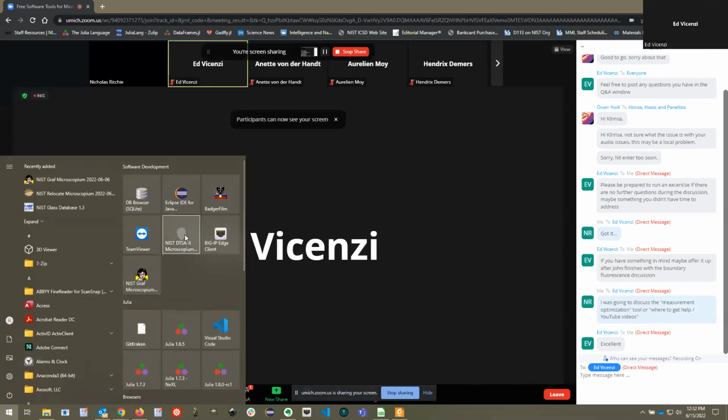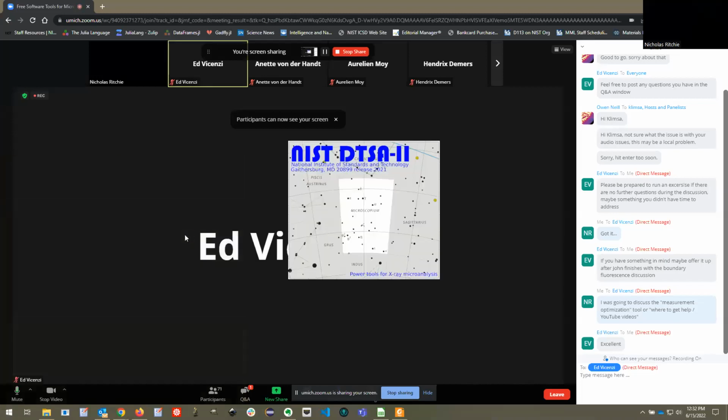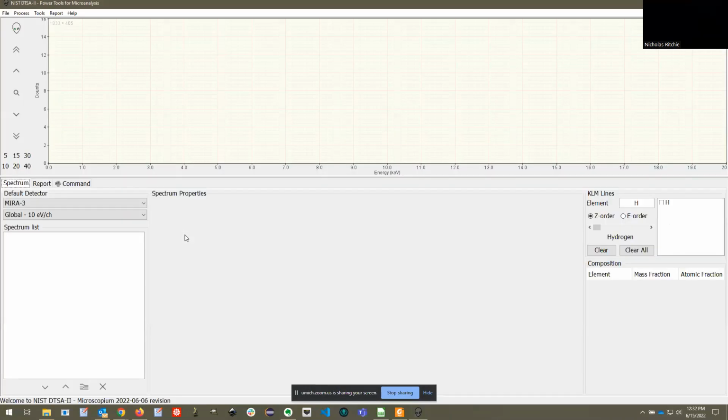Okay, let's get things started up again. So you should just be seeing DTSA-II starting again. If I had a couple extra minutes, which I do now, I was going to show you one more tool, and that tool is the optimization tool.